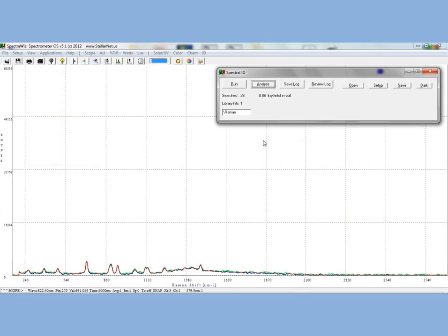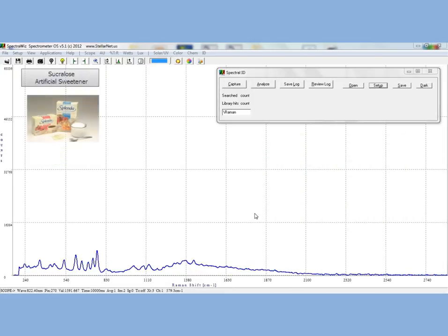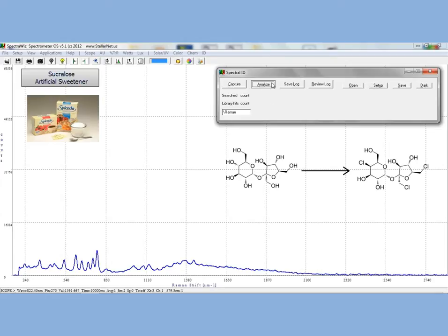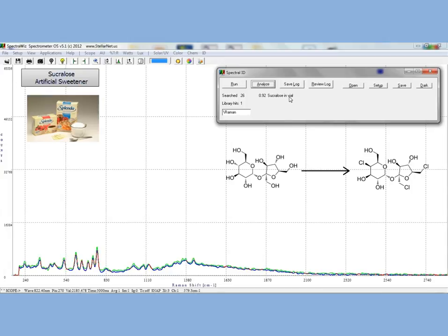Now we will measure the Raman Spectrum of sucralose, a non-caloric artificial sweetener made by chlorinating several of the primary alcohols of sucrose. This process makes sucralose approximately 600 times as sweet as sucrose. It also is stable under high heat, so it is good for baking and many canned products.